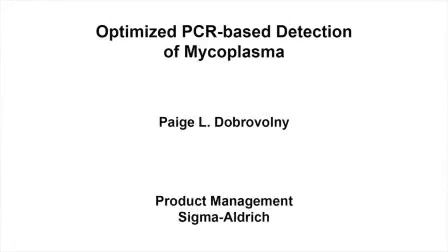The overall goal of this procedure is to visually demonstrate the steps for using the Lookout Mycoplasma PCR Detection Kit, optimized to detect mycoplasma contamination.